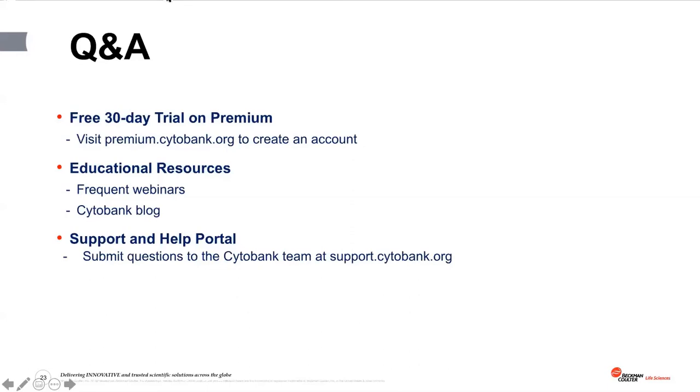Yeah, sure. Thanks, Alina. The answer is yes. In fact, we also created a Cytobank R script based on the Seurat package or Seurat algorithm. So, yes, in short, you can use it. But again, like I mentioned, there's no gold standard right now for how you should analyze your CITE-seq data and single-cell RNA-seq data. So I expect to see more and more new algorithms coming up, which will provide maybe better results for your analysis.